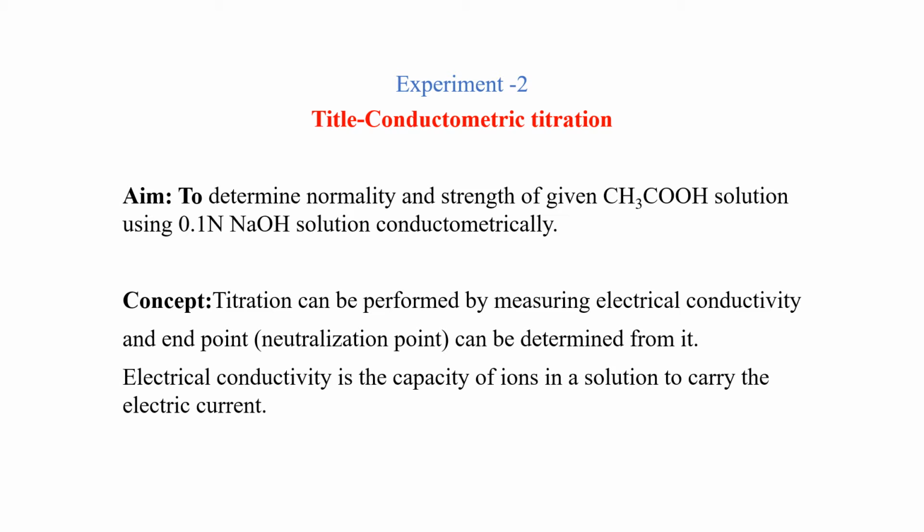The concept of this experiment is that the titration can be performed by measuring electrical conductivity, and we can determine the endpoint from this measurement. Electrical conductivity is the capacity of ions in a solution to carry the electric current.